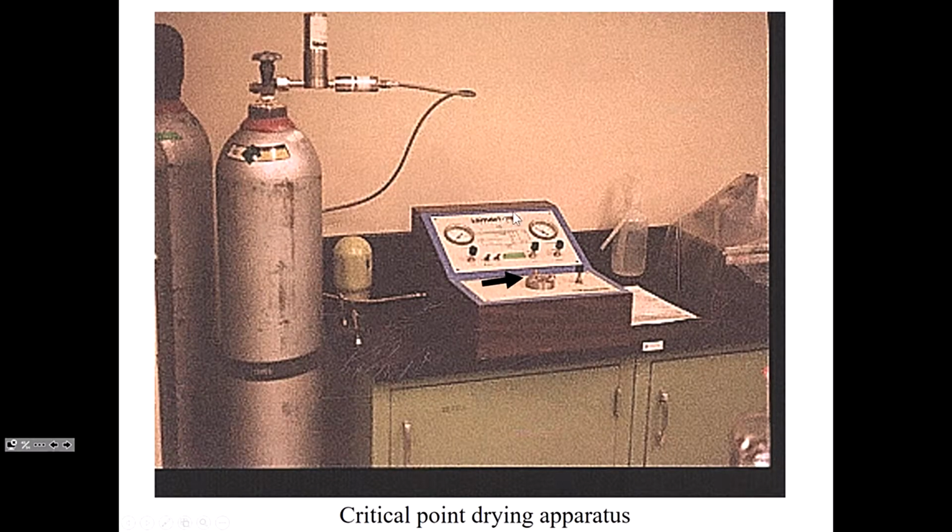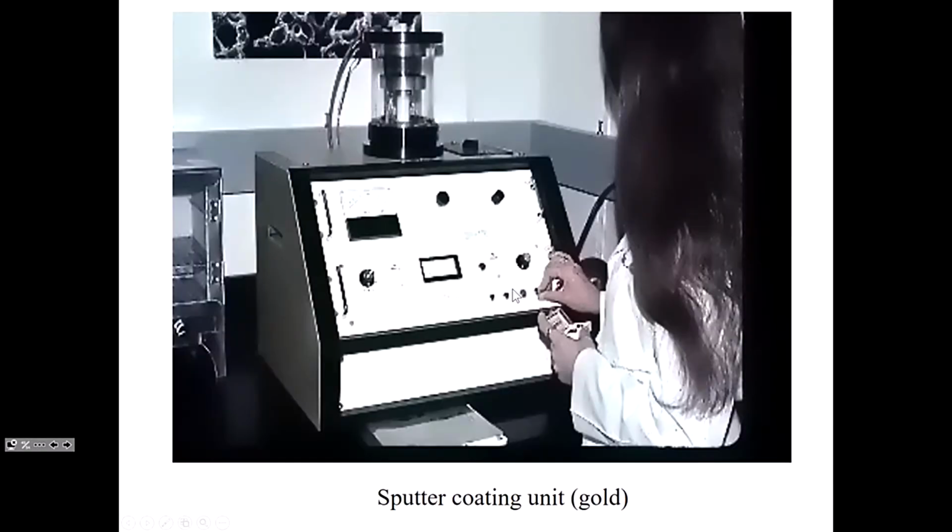We get rid of all the ethanol, so now what's left is just the proteinaceous material and nuclear material that was in the cell itself, and then we put it in what is called a sputter coating unit. So basically, a dried structure is sitting up here, and a mist of gold is sputtered over the surface of the structure. Okay, so we're covering the surface.